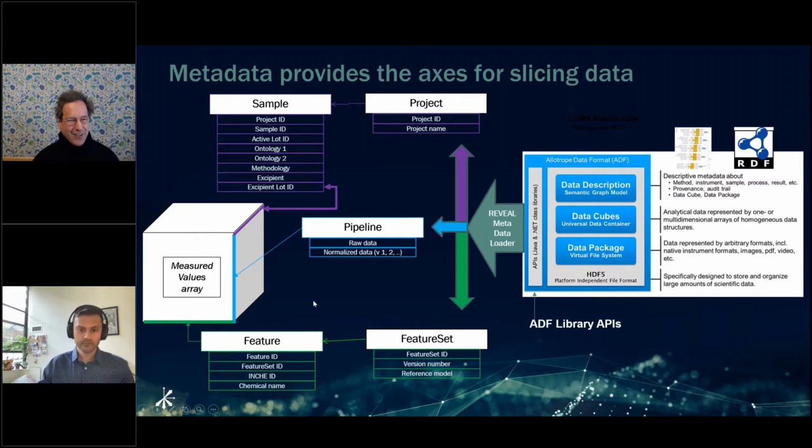is that you're storing. And the beauty is that the data then is stored in a cube on disk that allows the data scientists to slice that data out in a routine and reproducible way so that they can filter their interest using these arrays, the metadata, and arrive at the values that they want.